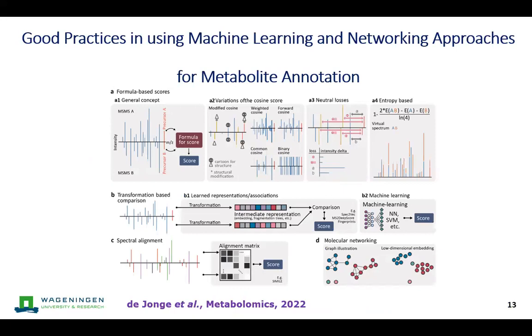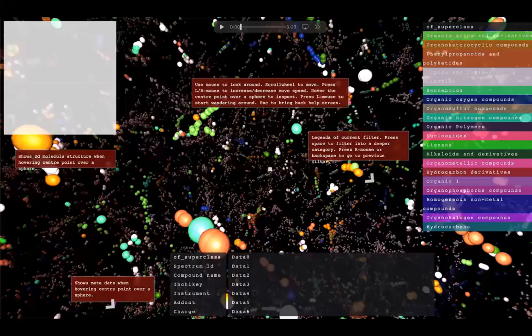And finally, I would like to share that we not only use these embeddings like we just did in the notebook, to produce the UMAP plots for initial screening. I also use them during teaching with the students. So here you see not a 2D representation, but a 3D representation.